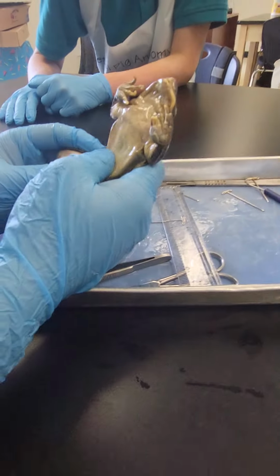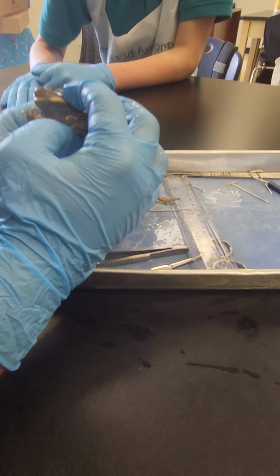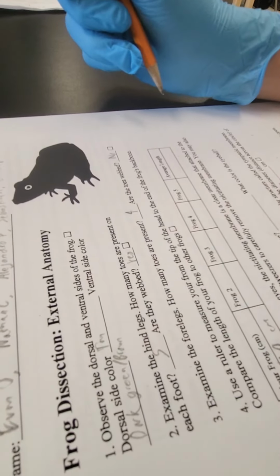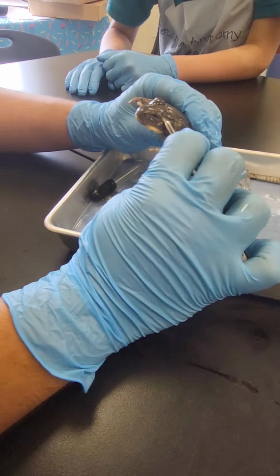What's the next step? Locate the frog's eyes. The nictitating membrane is a clear membrane that attaches to the bottom of the eye. Use tweezers to remove the nictitating membrane. You may also remove the eyeball. Oh no! Okay, this thing? Yeah.